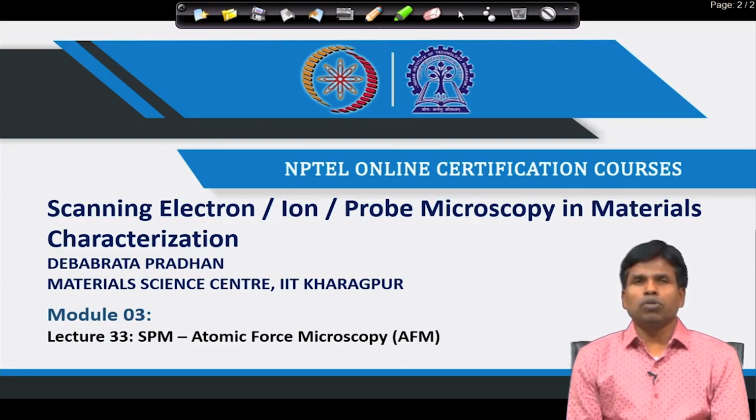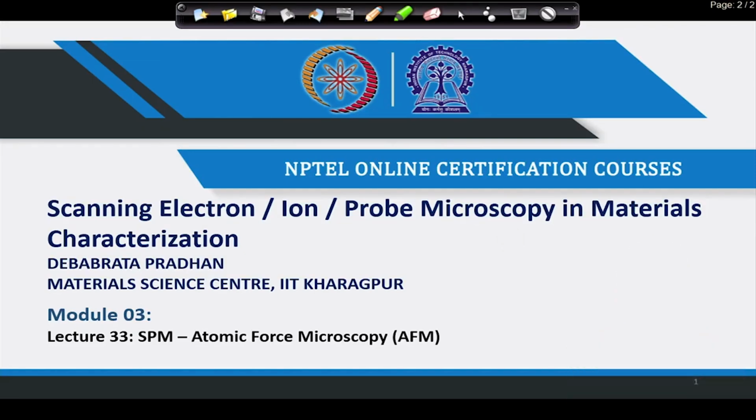In the last few lectures, we have discussed the scanning tunneling microscope, which is a type of scanning probe microscopy. Under that technique, we discussed how a 3D image can be achieved using the tunneling current. Today, we will begin with another probe microscopy, which is called atomic force microscopy.